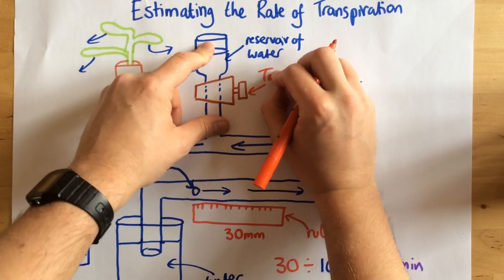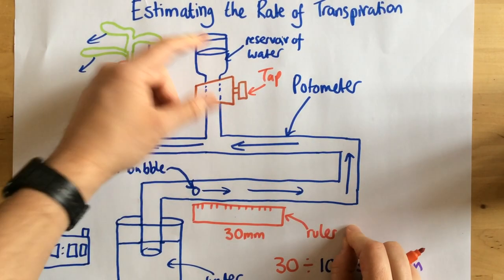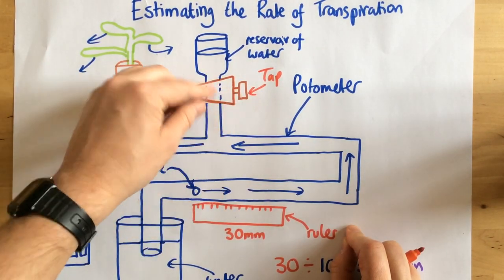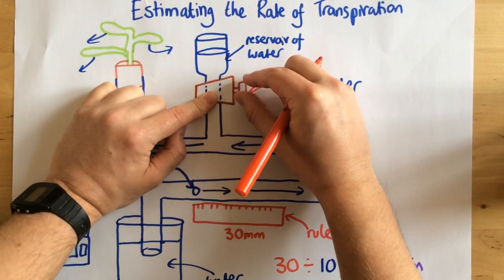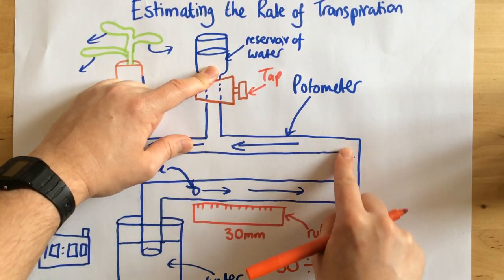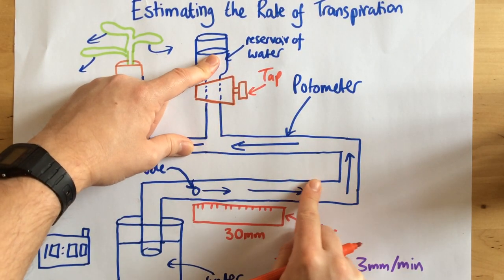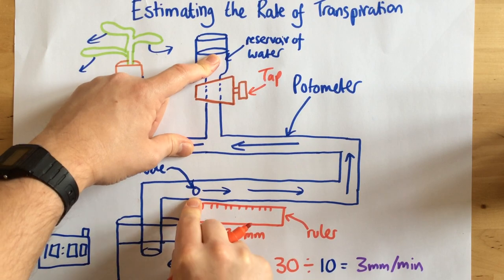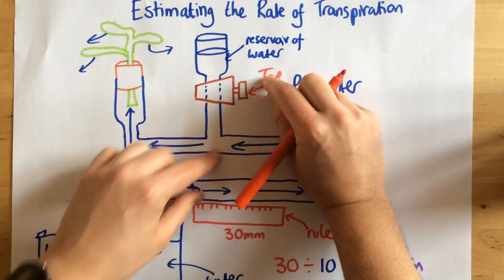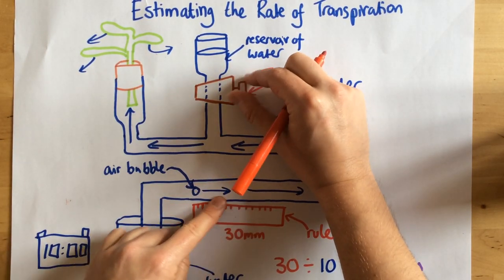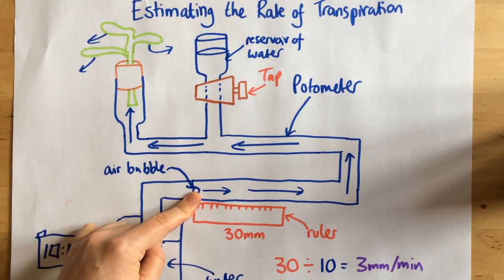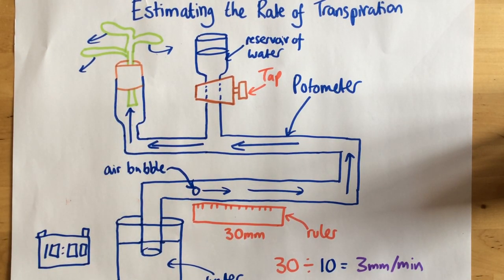So, the whole point of this reservoir of water and tap is really simple. During the actual experiment it's closed, all it's used for is I open the tap to allow the water to flow down here, just to restore the bubble to the starting position that I want. So once I've done the experiment once, I just open the tap to put the air bubble back to its starting position, and then I can go again.